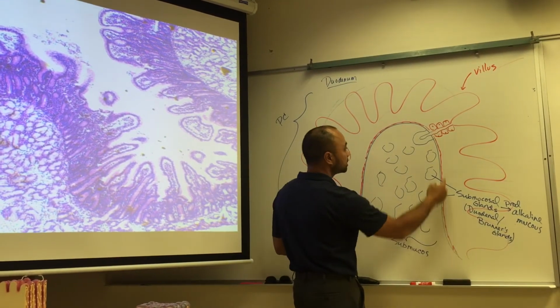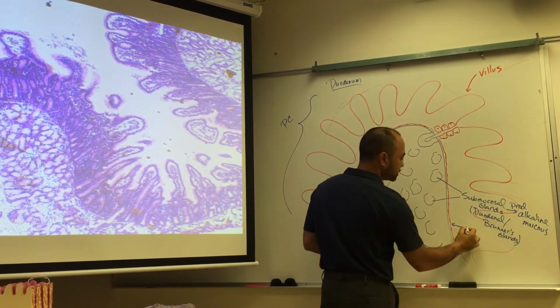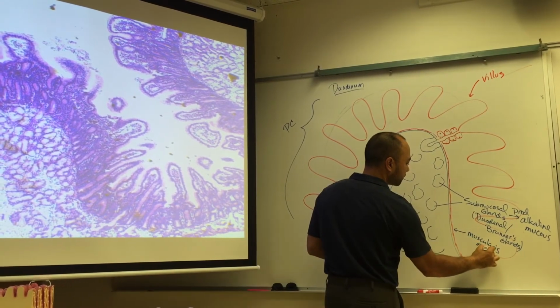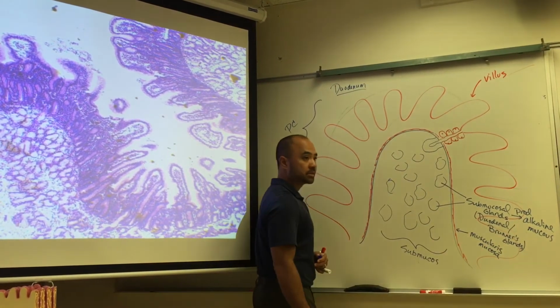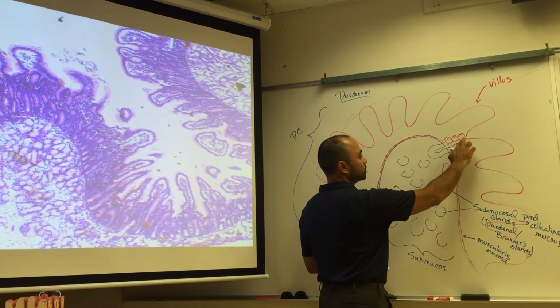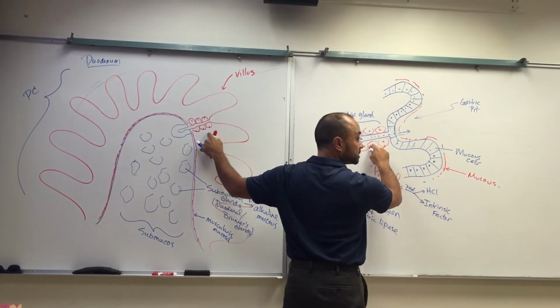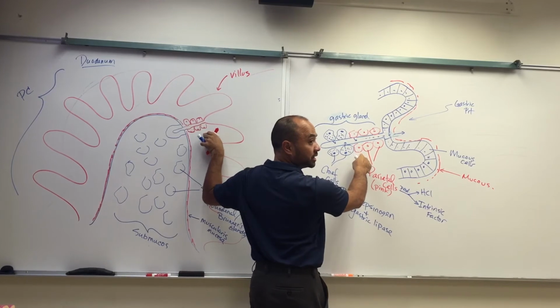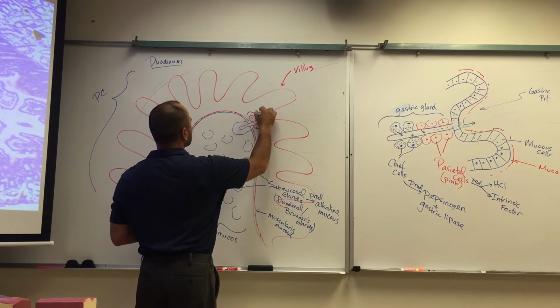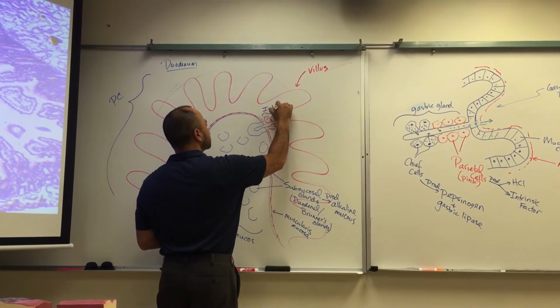And then here, what do you want to call that muscle layer? Again, it's that muscularis mucosa. Like so. And notice how this pathway was really similar to this pathway right here. Does that make sense? We call this the gastric gland, right? This is not in the stomach anymore, so make up a name for me. We're going to use that name, okay? So this is the intestinal gland.